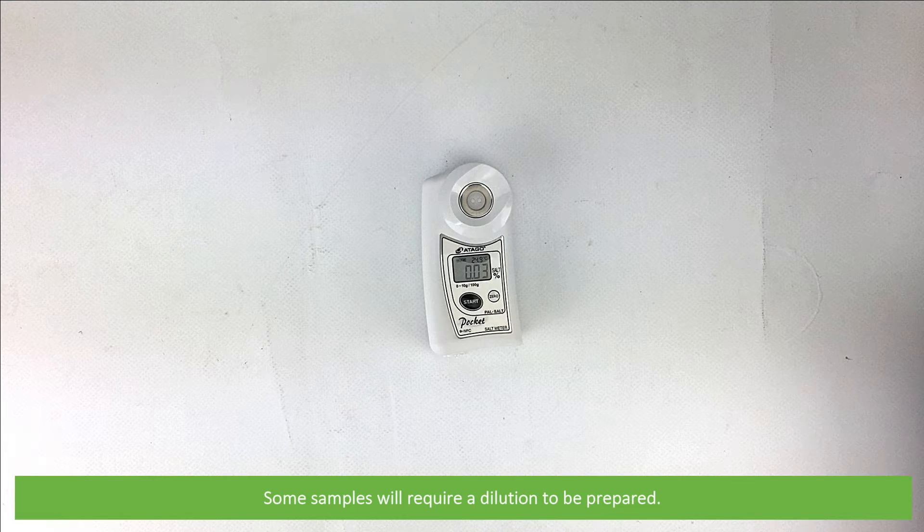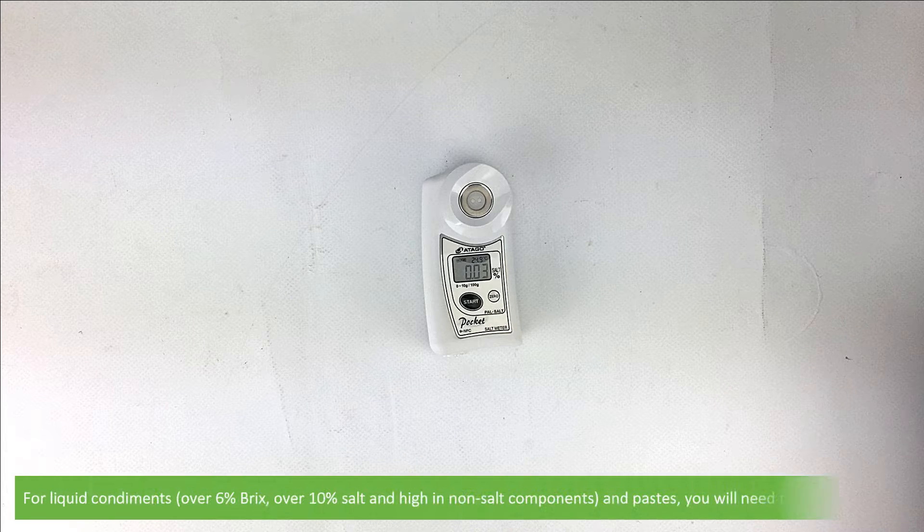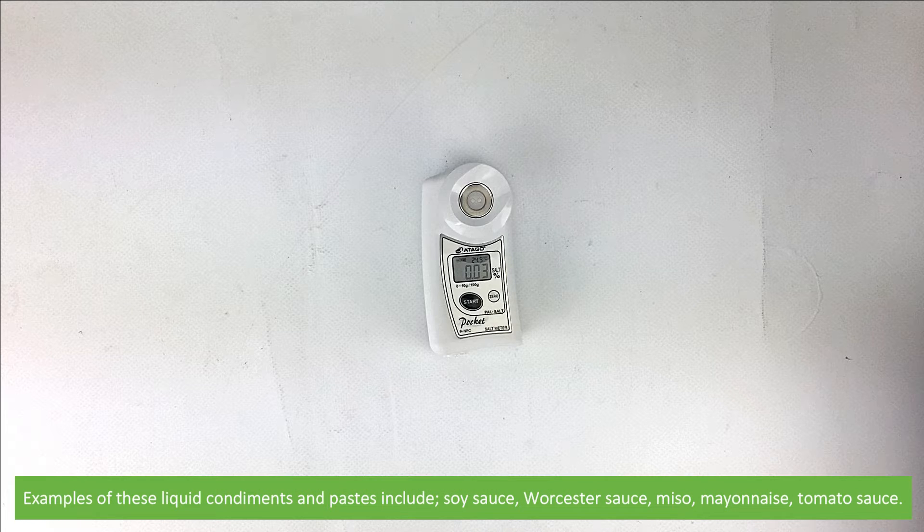Some samples will require a dilution to be prepared. If the sample is less than 6% brix and less than 10% salt, there's no dilution necessary. For liquid condiments over 6% brix, over 10% salt, and high in non-salt components, as well as pastes, you'll need to make a dilution. Examples of these liquid condiments and pastes include soy sauce, Worcestershire sauce, miso, mayonnaise, and tomato sauce.